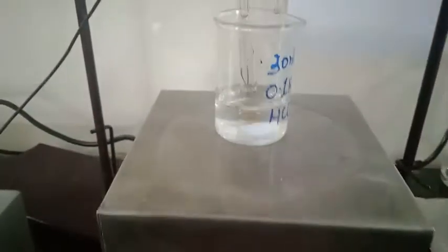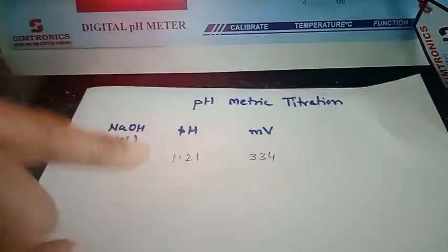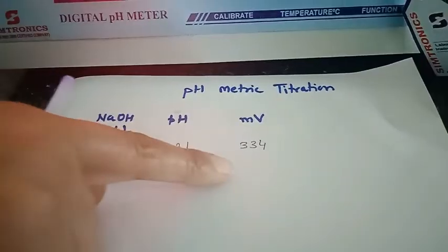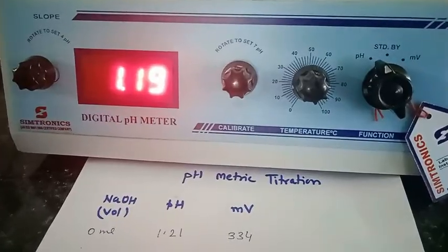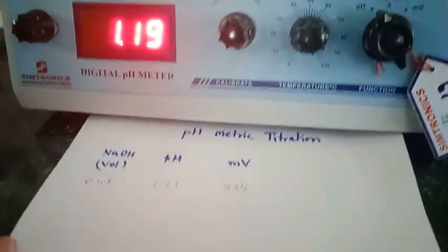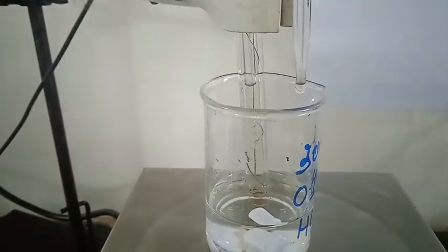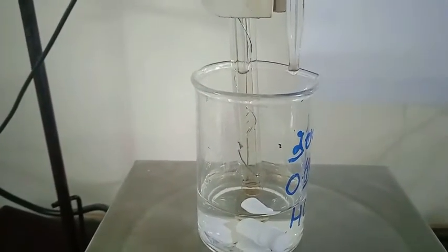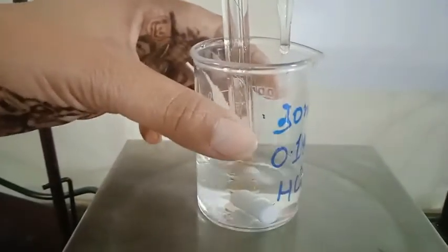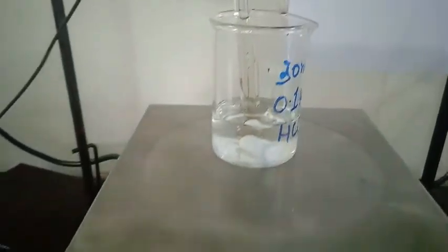Now I take 30 ml of the 0.1 normal HCl solution. For 0 ml — meaning before adding any NaOH — we take the initial pH and millivolts reading from the pH meter. Here you can see the electrode, and we are going to add NaOH solution from the burette. The setup is kept on a magnetic stirrer.